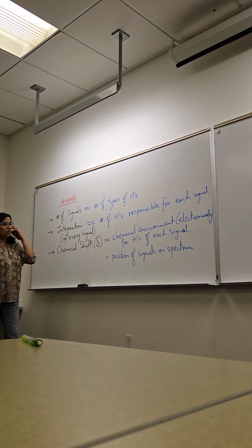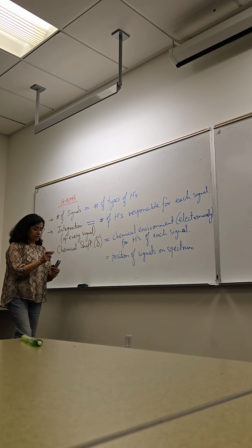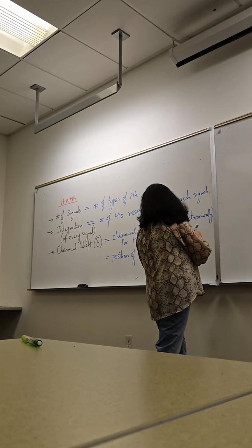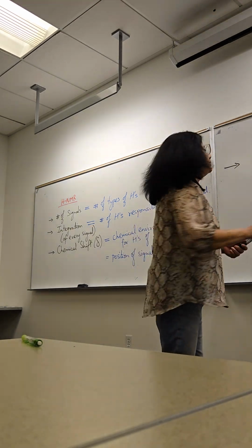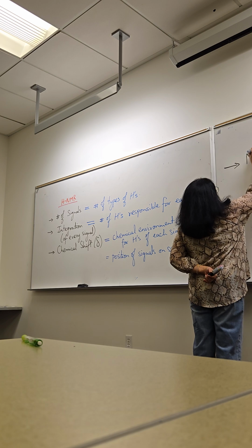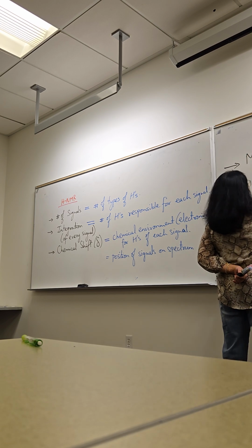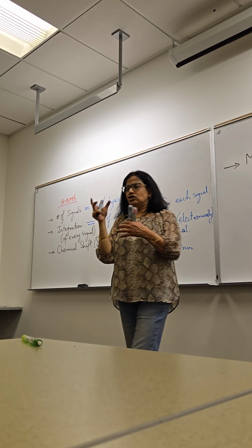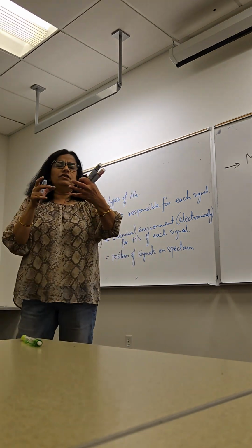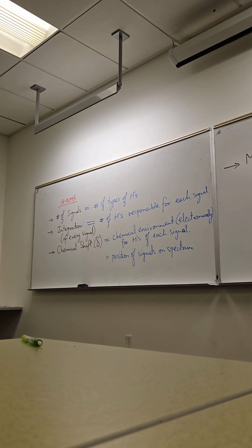Although when I work through NMR, I think this is probably the last thing I go for, but we will discuss it third. And the last feature, which is one of the most important parts of proton NMR spectroscopy, is called multiplicity, also known as coupling. The magnetic field of one set of hydrogens can actually couple with the magnetic field of the neighboring set of hydrogens, which creates some predictable changes.